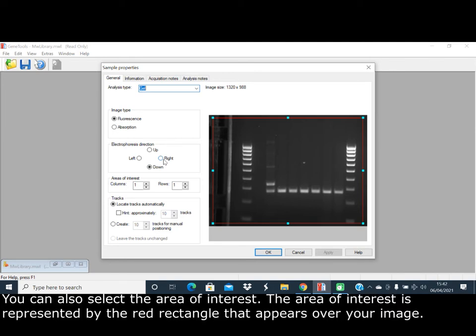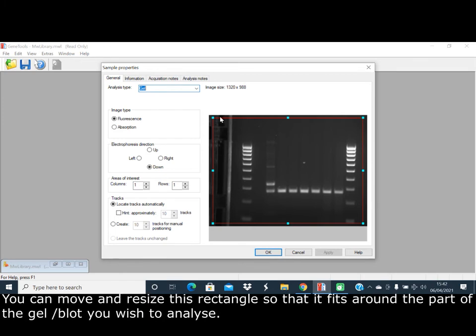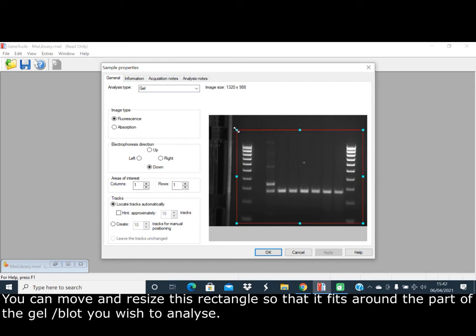You can also select the area of interest. The area of interest is represented by the red rectangle that appears over your image. You can move and resize this rectangle so that it fits around the part of the gel or blot you wish to analyze.